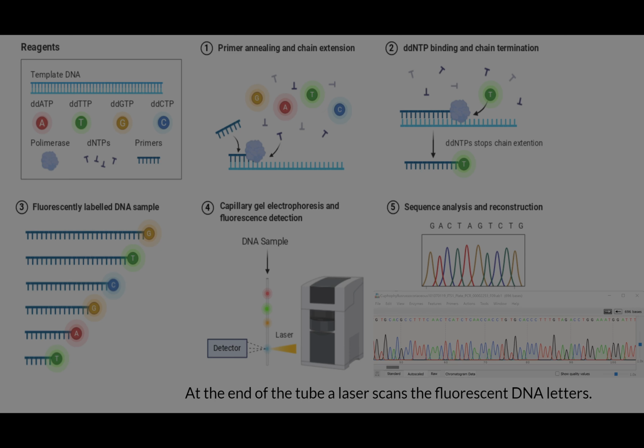So let's go over this again. So we start out with our PCR product, which now we're calling template again. It's what we're starting a new round of PCR with. Here's our dideoxy nucleoside triphosphates and all the other components. And so we do our PCR.